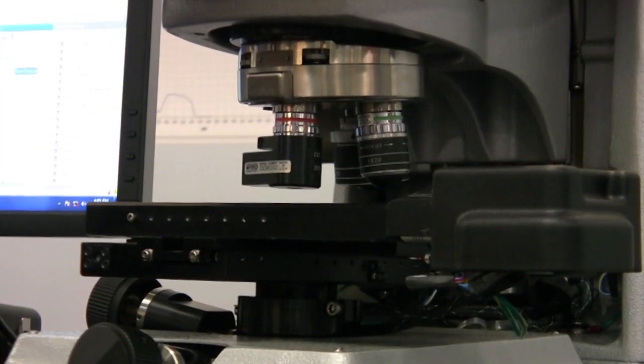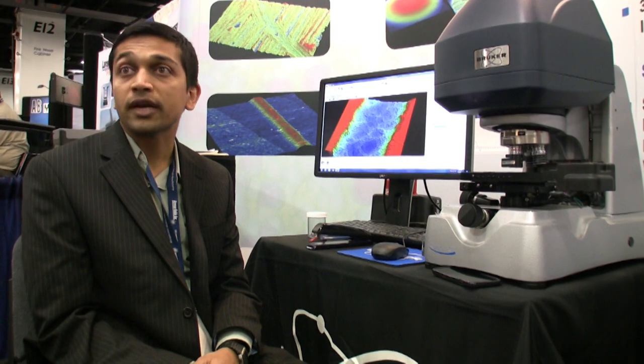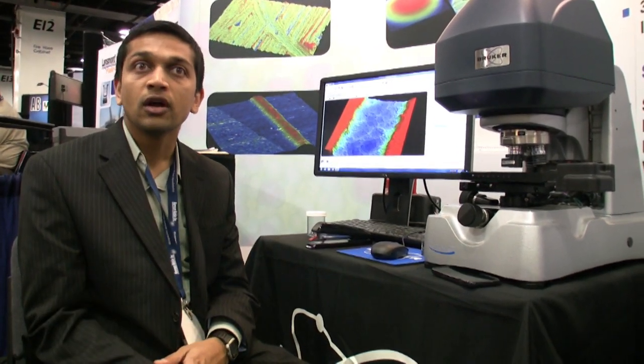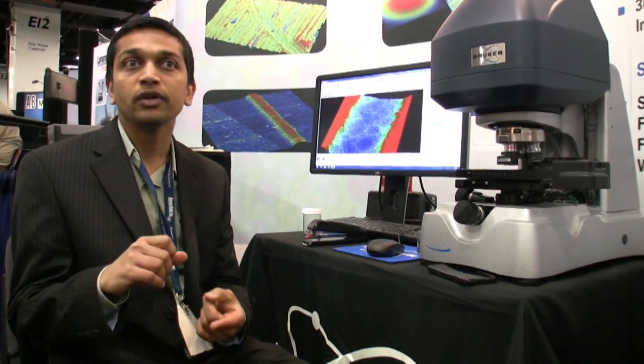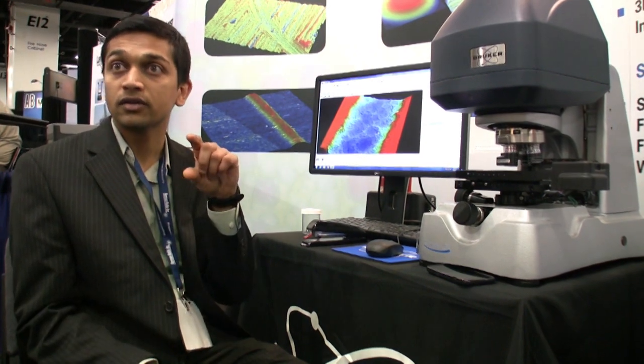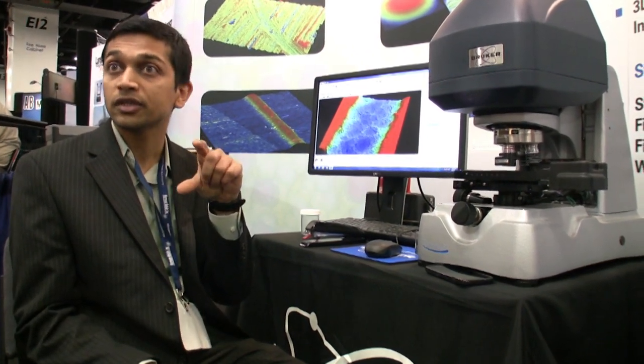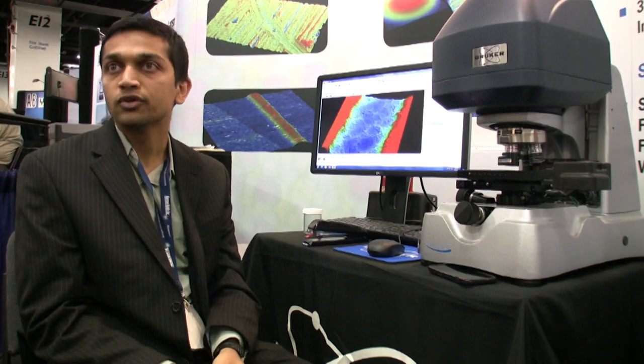You can use it anywhere from measuring texture on medical optics - super smooth surfaces - to something as rough as a tire, like carbon black on a tire. So anywhere where you need to do very accurate dimensional measurements in the Z direction and the XY direction, you can use this.